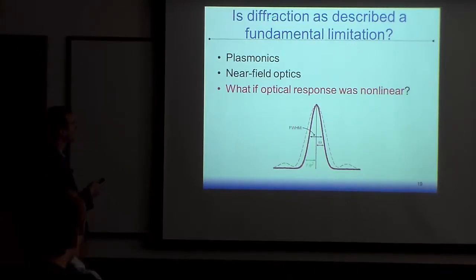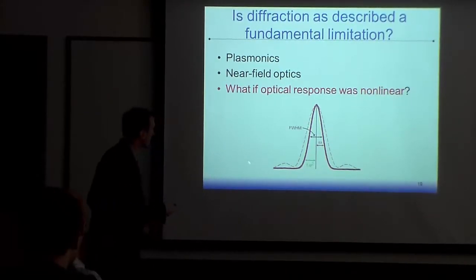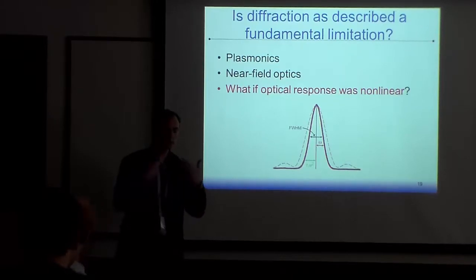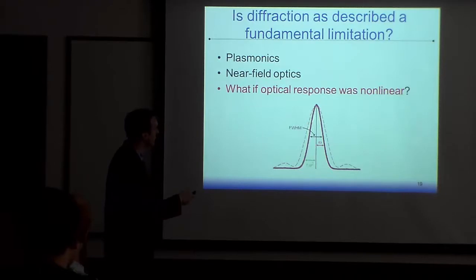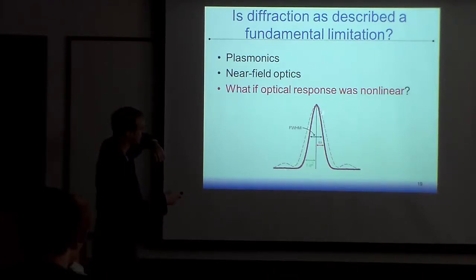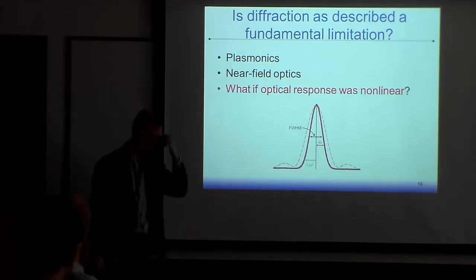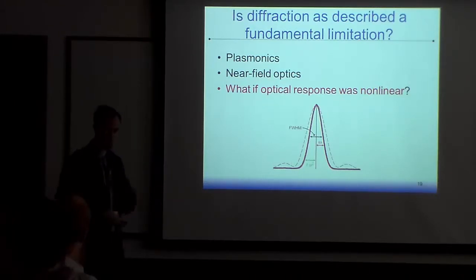And the other thing is saying, okay, well, are we really diffraction limited based on what we get from a plane wave incident on a material? If I drew this Airy disk here, I have this dashed line. Okay, that's what it looks like. But imagine a material where the response you get back is not a function of intensity, like you would get from just a pool of fluorescent dye where you can put a flashlight in it, but is proportional to intensity squared. So you can picture the Airy disk here, these higher peaks you kind of pull up, and then these lower peaks don't really get pulled up as much. And you actually end up with something that's pretty Gaussian. This little red line here is the actual function, and this dashed line is the Gaussian fit to it. And you can see that there's a narrowing of this width to the point where you can actually see something on the order of hundreds of nanometers optically, if you can make something that's nonlinear.